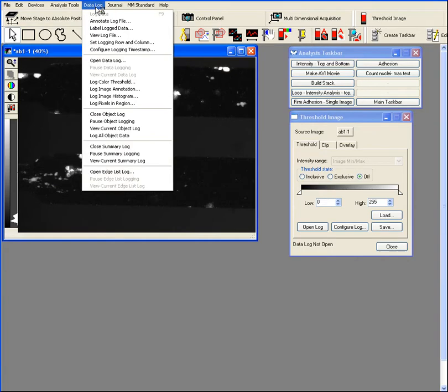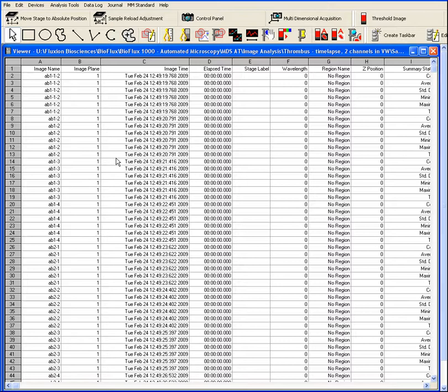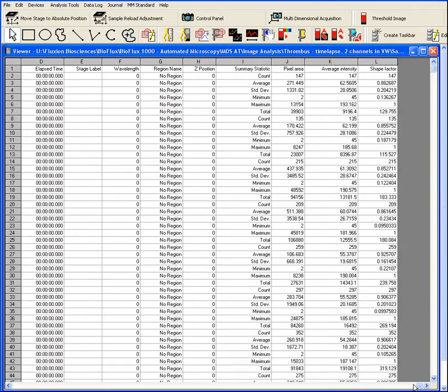So we can come in under the log and we'll view the current summary log. And what we see is a compilation, a database, of all the images that were processed.